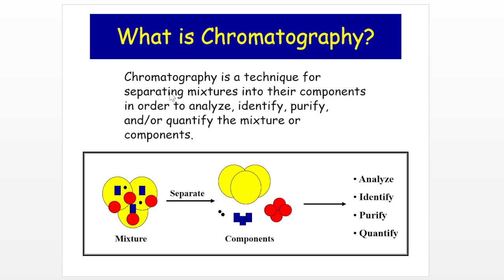First of all, what is chromatography? Chromatography is a technique for separating mixtures into their components in order to analyze, identify, purify, and quantify the mixture or component of the mixture. Here in the diagram you can see the mixture is shown, and later after chromatography the mixture is separated into its components.